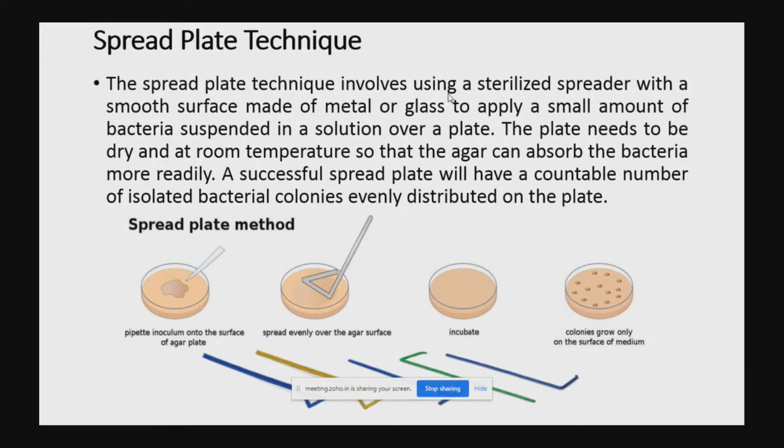Regarding the techniques in microbiology, first of all, there is the spread plate technique. What is the spread plate technique? It involves using a sterilized spreader with a smooth surface, made of metal or glass, to apply a small amount of bacteria suspended in a solution over a plate. The plate needs to be dry and at room temperature so that the agar can absorb the bacteria more readily. A successful spread plate will have a countable number of isolated bacterial colonies evenly distributed on the plate.